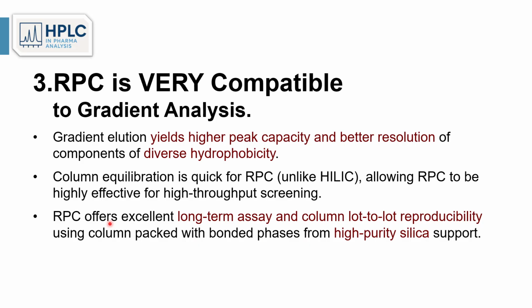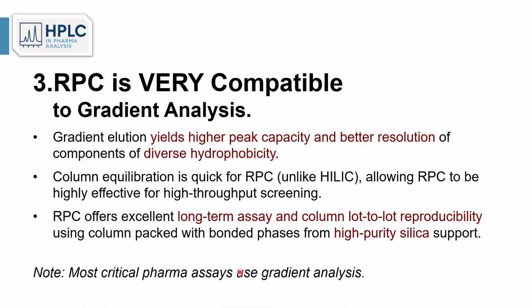Finally, reverse phase offers excellent long-term assay and column lot-to-lot reproducibility using columns packed with bonded phases from high purity silica support. A note, most critical pharmaceutical assays use gradient analysis.